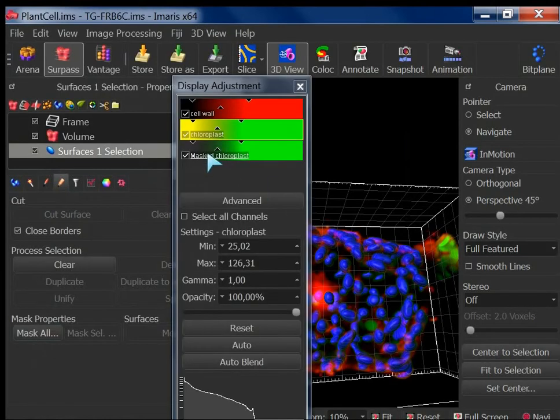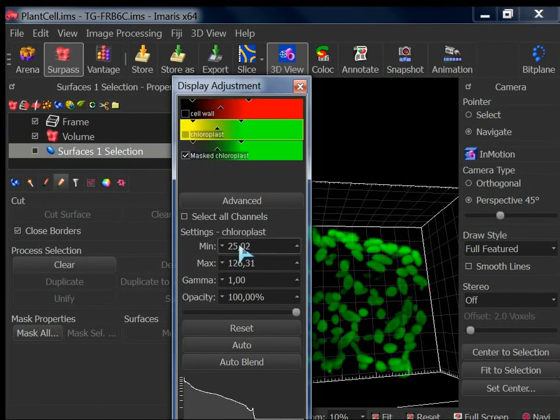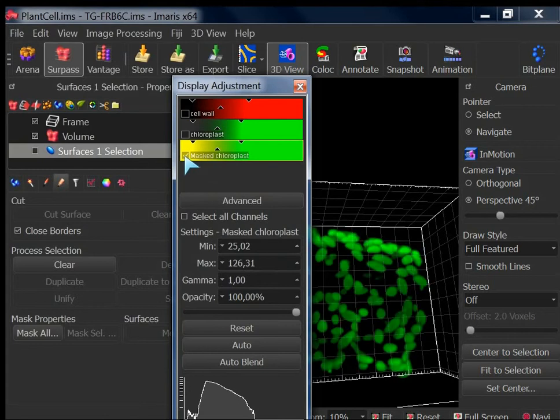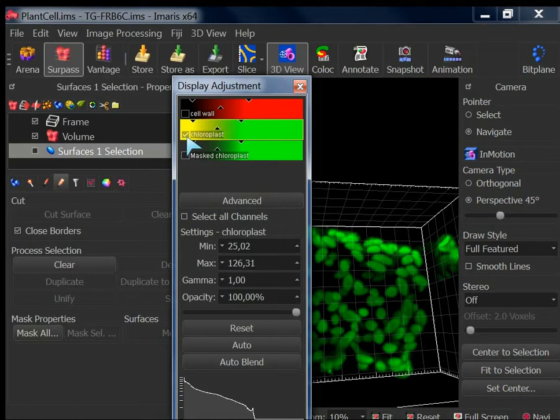Now if you see, there must be 3. See the mask one? Let's look at them, what they look like. Switch off. So it's mask one that we have already seen. This is the first one. Right?